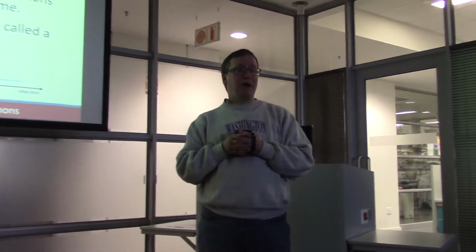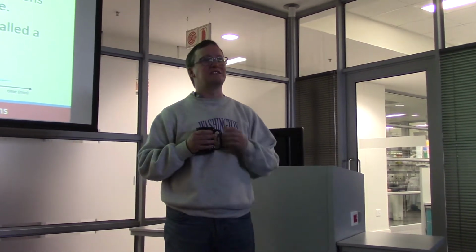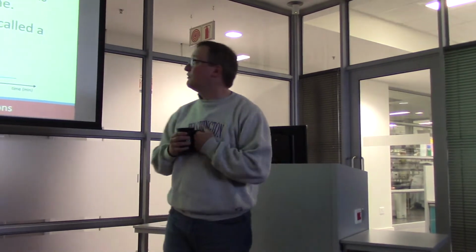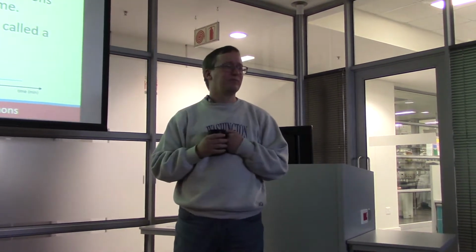Everybody should be ready to define the term chromatogram after hearing this lecture. I'm sorry, that's my obligatory, I like asking questions about this topic warning. Chromatograms are the natural result of chromatography.